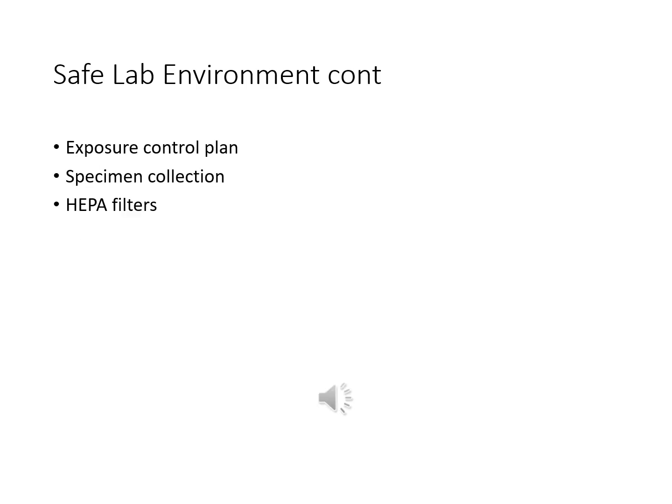Also in the laboratory, make sure that you review the exposure control plan for your facility. Make sure that you understand the specimen collection requirements. And some laboratories will have a HEPA filter placed in their biohazard hoods for extra protection.